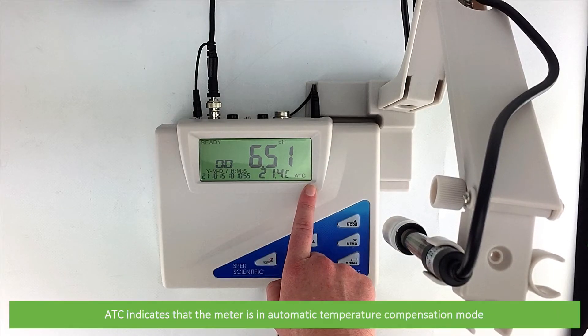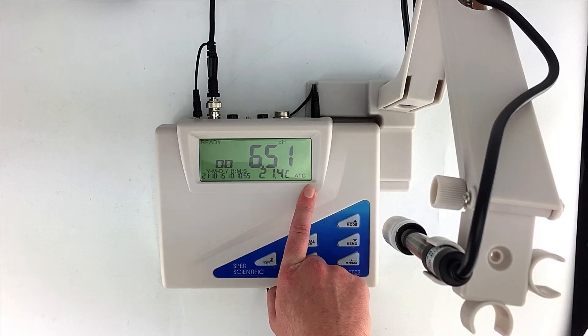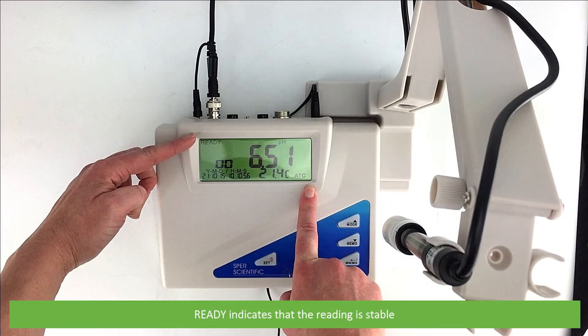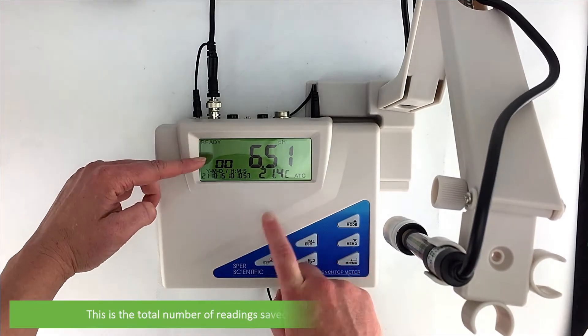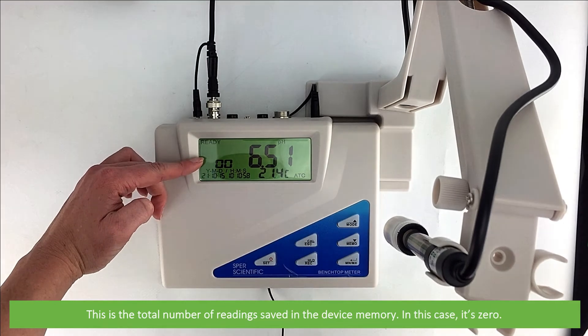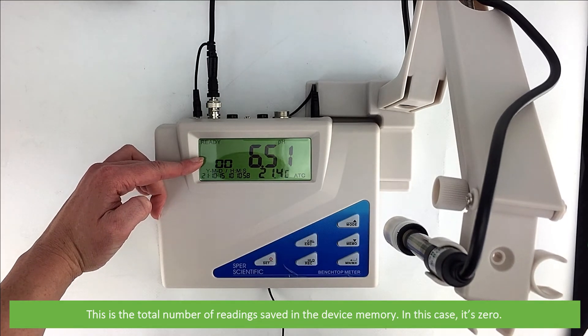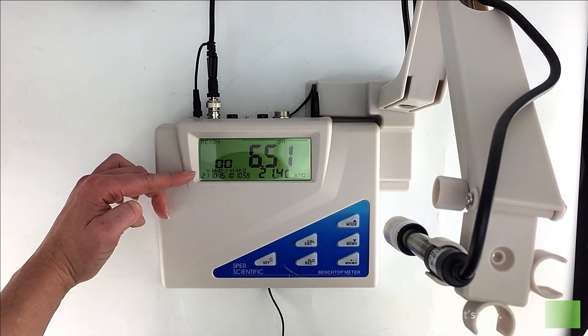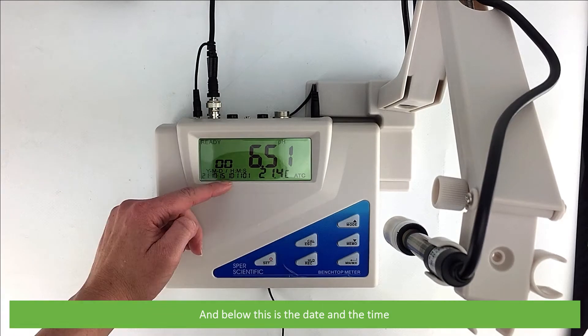ATC indicates that the meter is in automatic temperature compensation mode. Ready indicates that the reading is stable. This is the total number of readings saved in the device memory, in this case zero, and below this is the date and time.